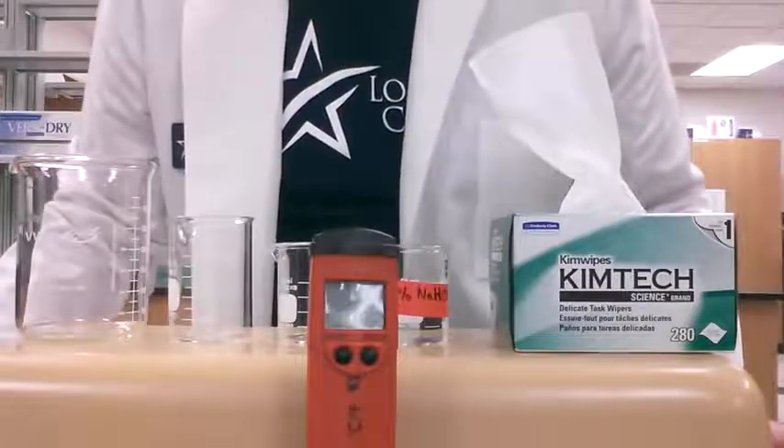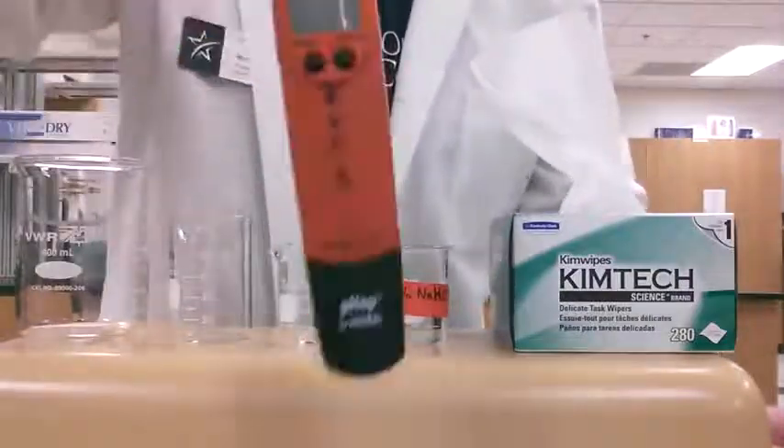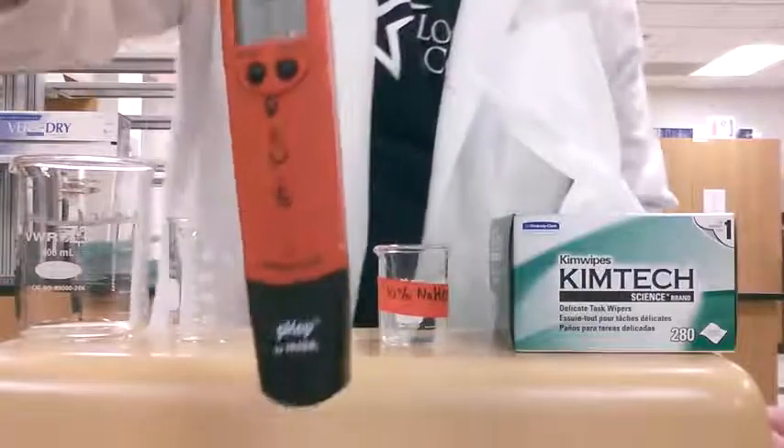We're going to do a short review of how we use the new pH meter — that's this thing right here. This is a new handheld pH meter, really easy to use.